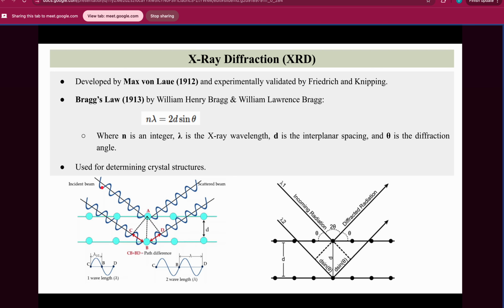Now let's see in this figure how the incident beam is coming, and this is the point A. If we talk about proteins, these are the smaller atoms present in the protein, and multiple atoms will be present. Ultimately, our aim is to see the distribution of those atoms, the coordinate position of those atoms. We want to capture it with X-ray diffraction.